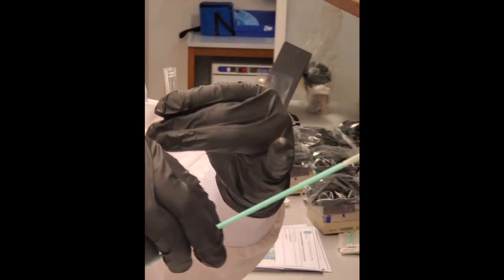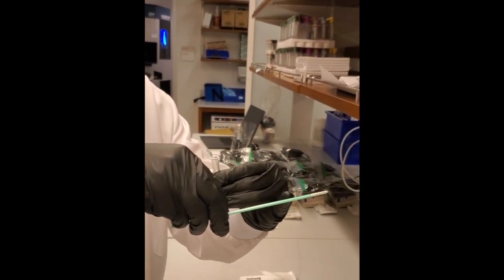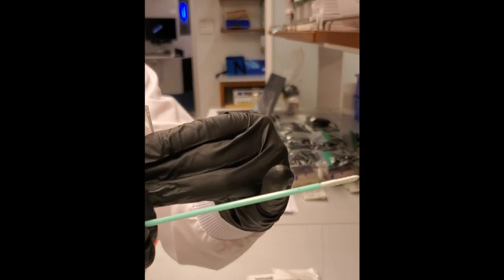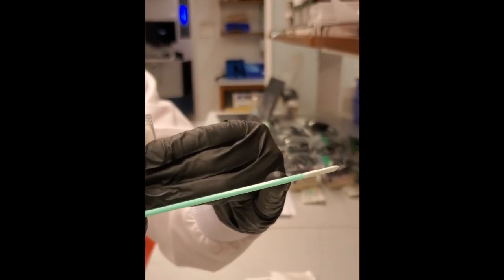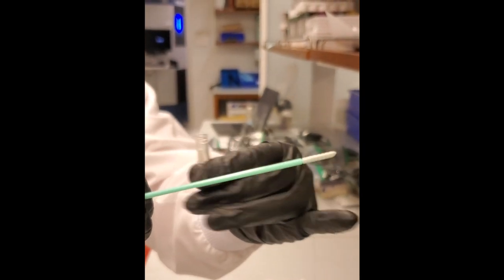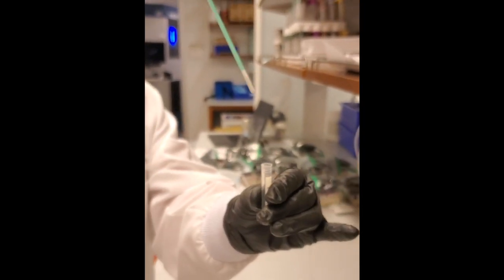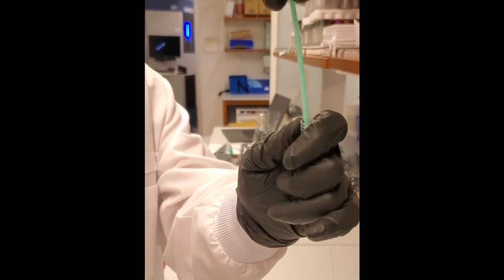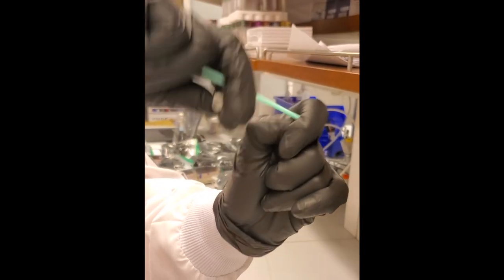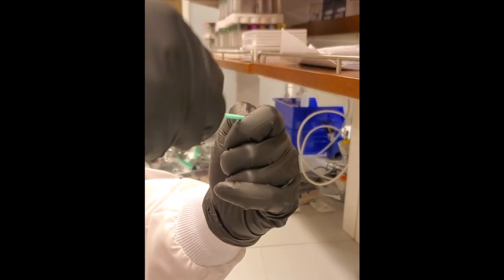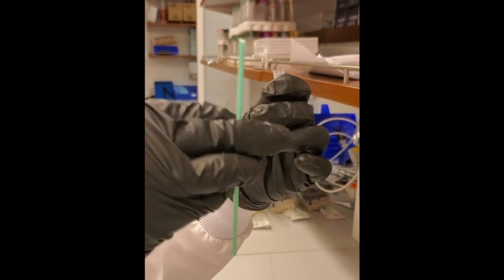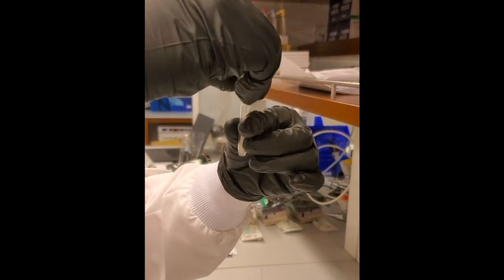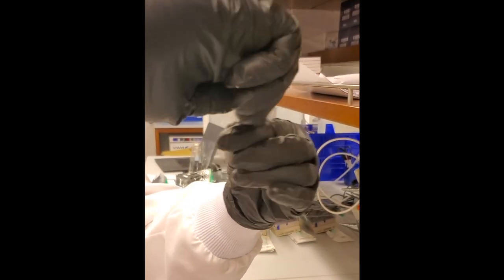You're going to snap the end of the swab inside the bar-coated tube. Gently insert your swab, snap it off, twist it a little bit, and you can discard this end. Then carefully put the cap on.